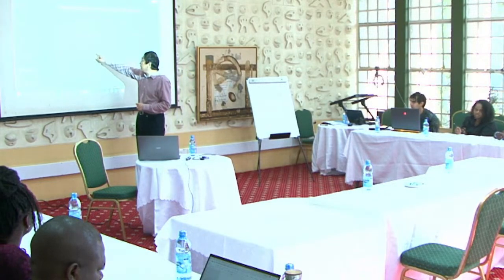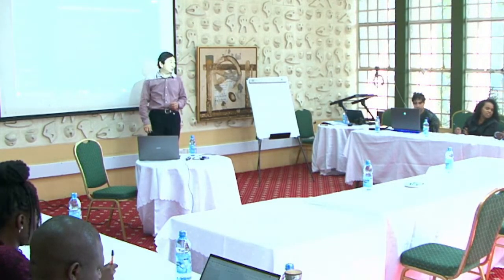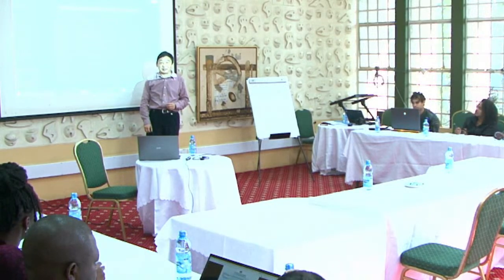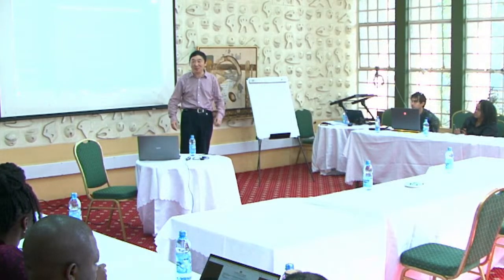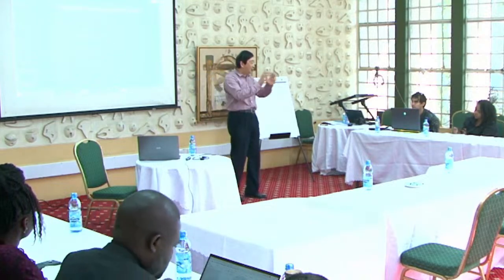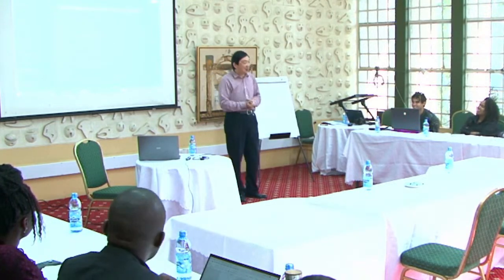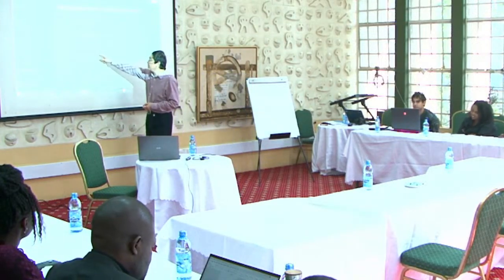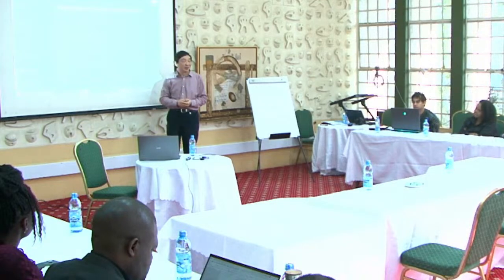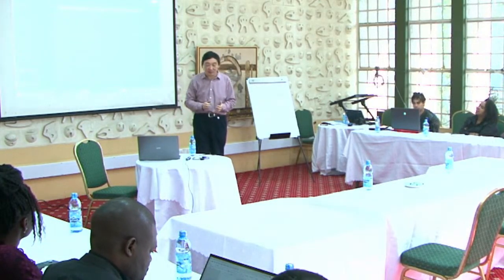Like 91, remember 91? Yeah, from yesterday to today, I do not know how many times I have mentioned that. So if you have an exam, you hope you can see a 91 so that your question becomes much easier. 105 is related to 91. Okay, so this kind of peak you want to remember.